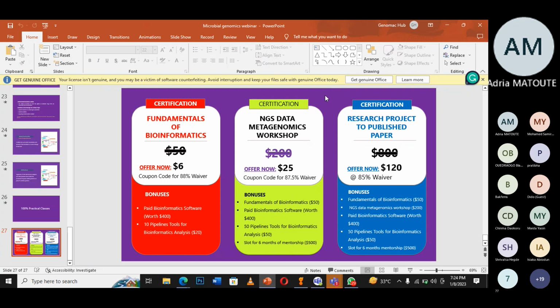So since you are using 16S, imagine maybe when the time comes you want to do shotgun, or you have a student, because looking at you, I think you're a professor. I'm a lecturer. Exactly. So having a PhD student who wants to do metagenomics or shotgun metagenomics, you already have the experience, you already have the idea, you already know the tools to use. So definitely it will work out for you.